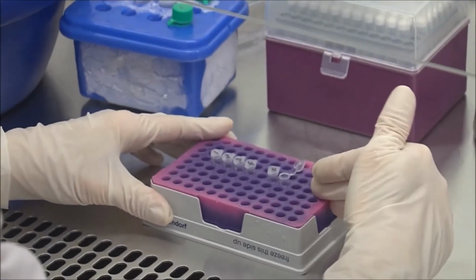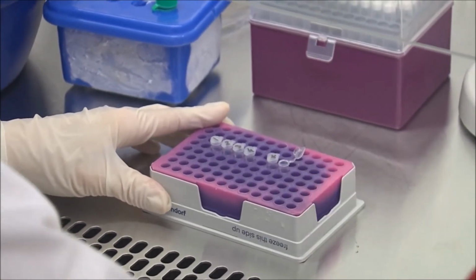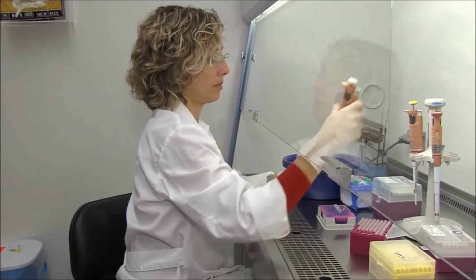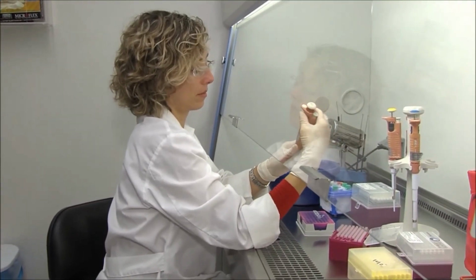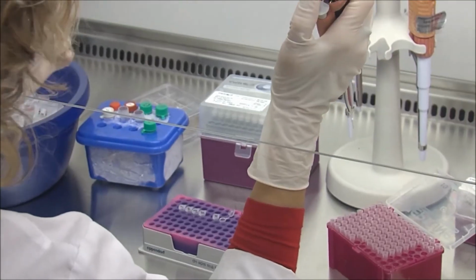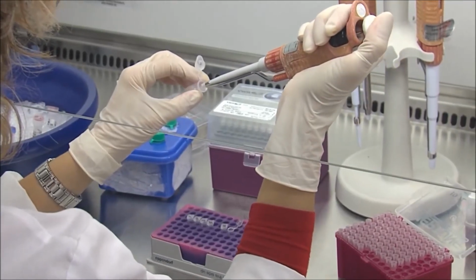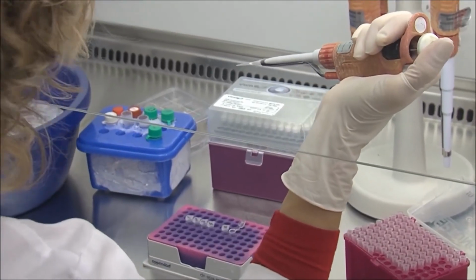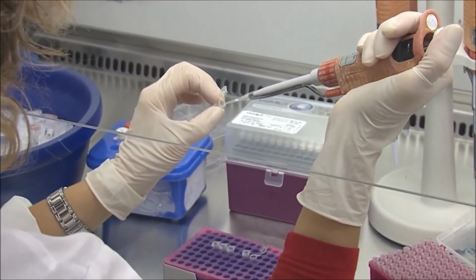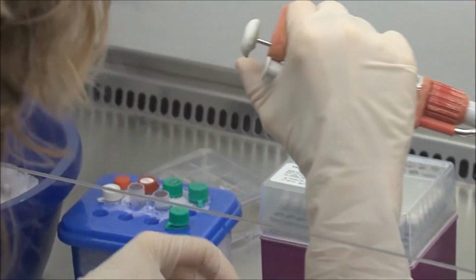So now we just have to add the samples, and I'm going to leave my negative control tube open until the end. Okay, cô ấy sẽ để cái phản ứng chứng âm, tức là negative control, mở suốt trong quá trình cô ấy thao tác các mẫu còn lại. Thì cô ấy đang hút cái mẫu DNA xét nghiệm đầu tiên vào phản ứng đầu tiên. Phản ứng đó đã chứa cái hỗn hợp phản ứng PCR.